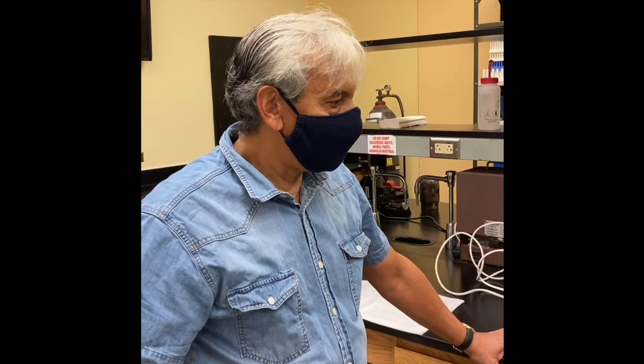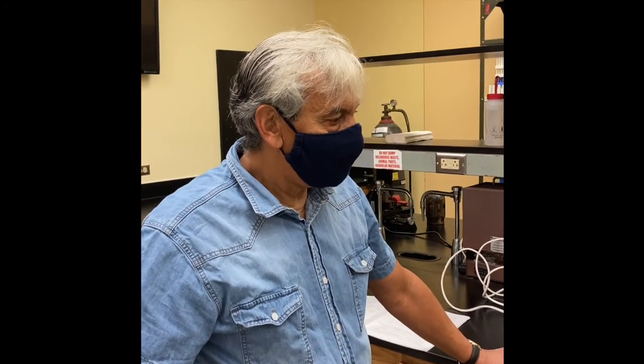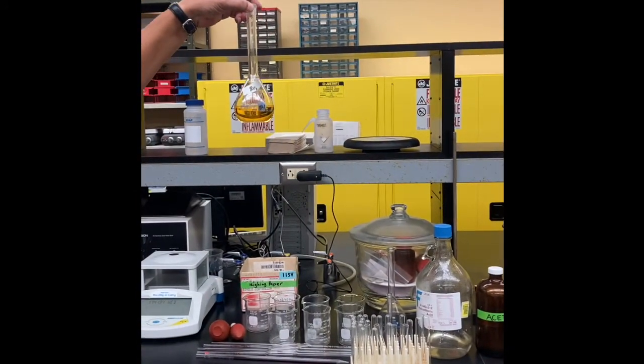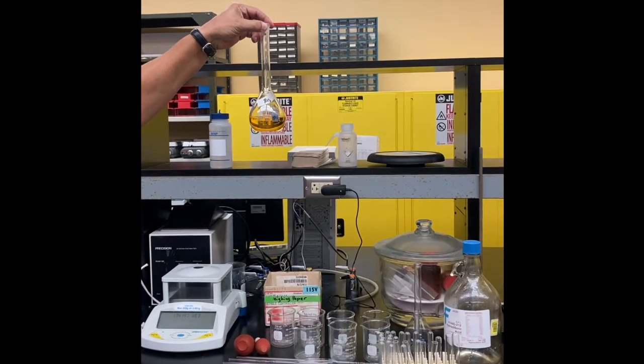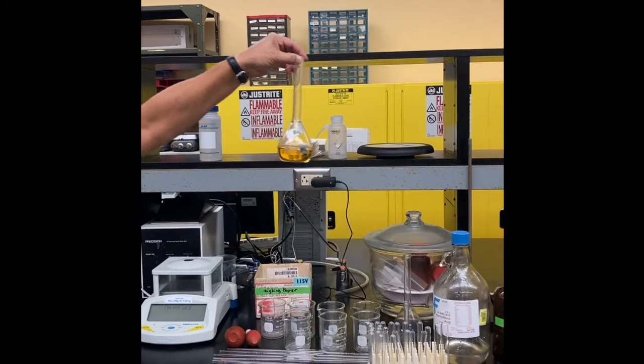The bromination reaction will start immediately when bromine solution is added to our mixture. You can see the bromine, which was prepared in advance of this experiment, although you can prepare it by yourself if you follow the lab manual.